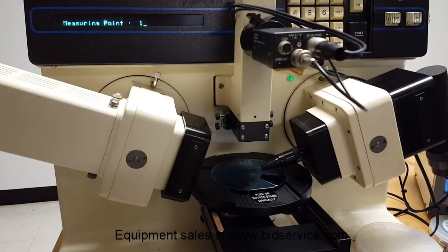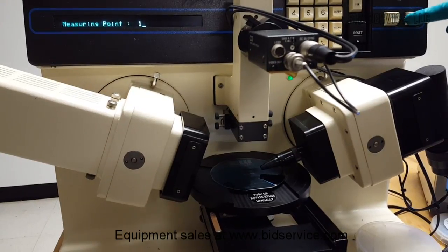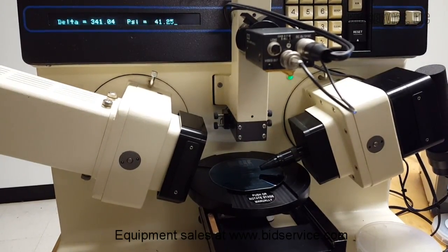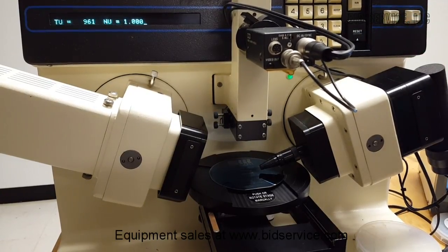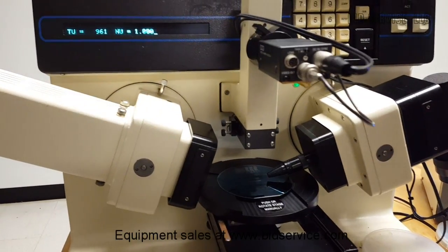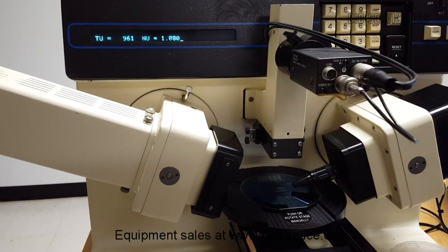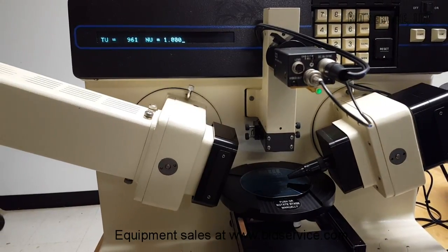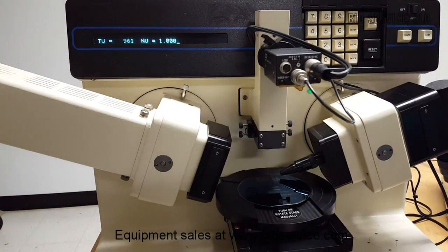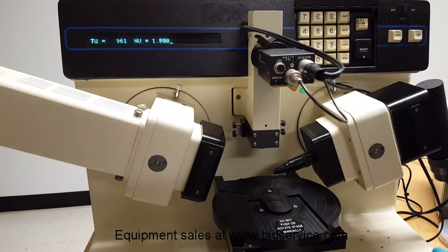At any point of time, to halt the measurement, the escape button can be pressed, and the reset button can also be used to reinitialize the stage. So that's the measurement here. That's the sample, silicon nitride.